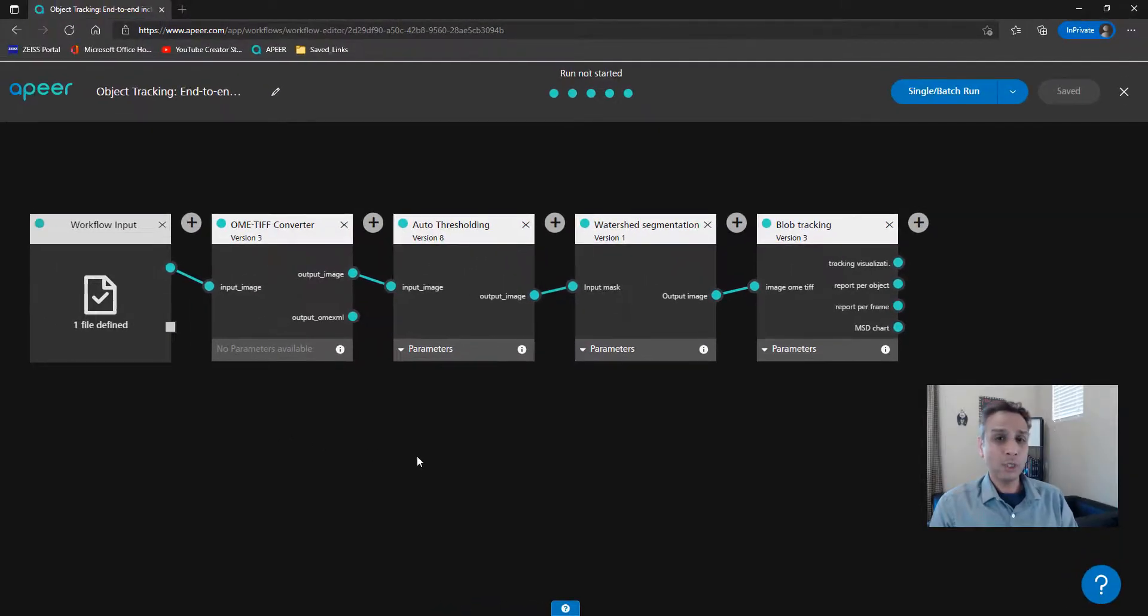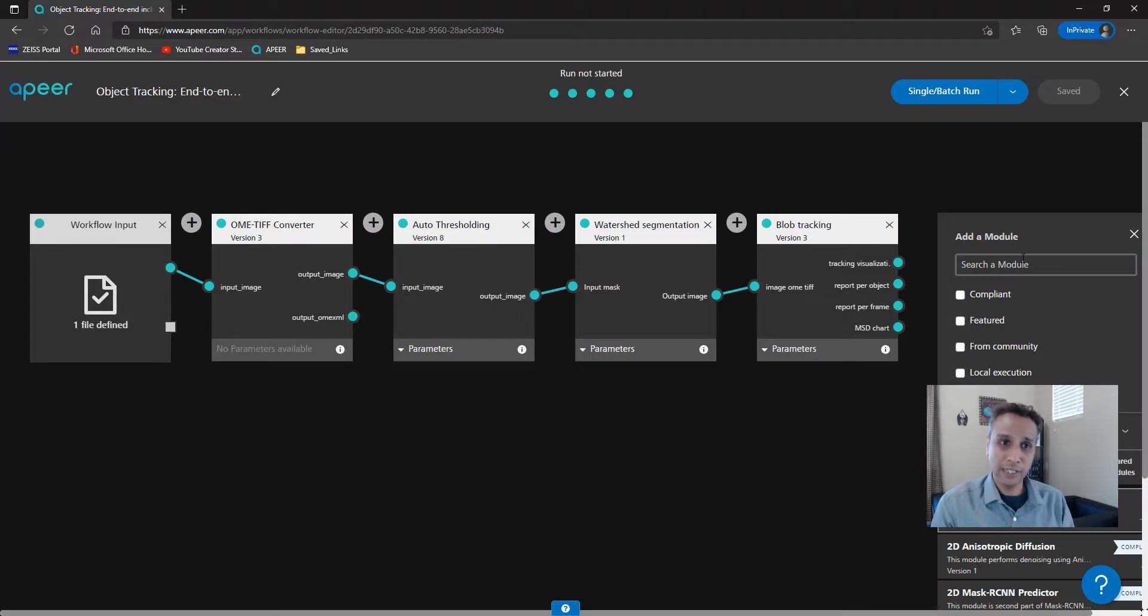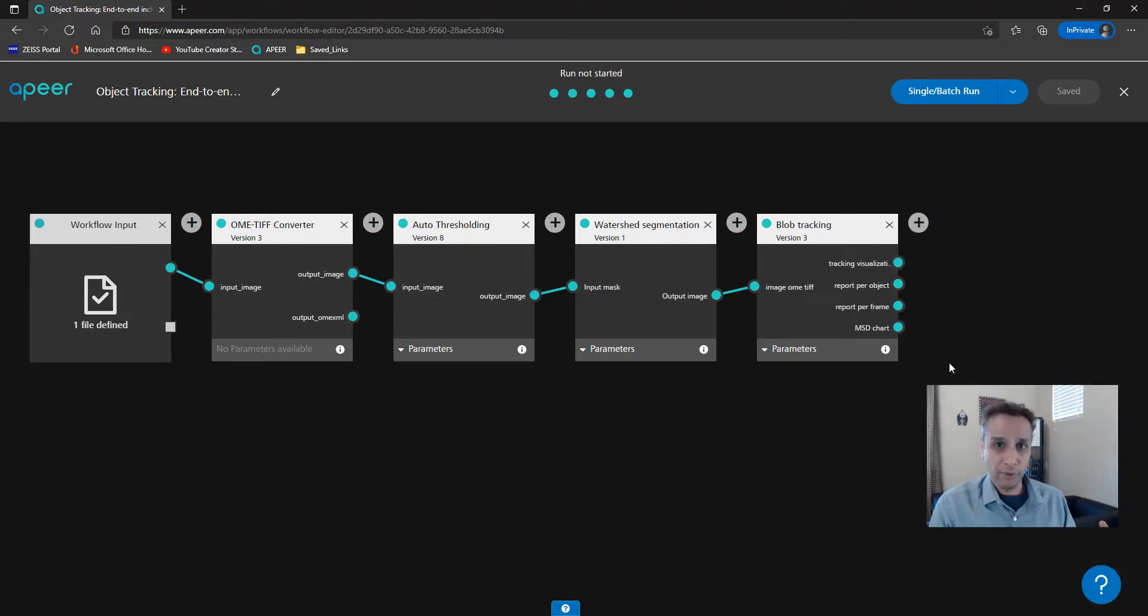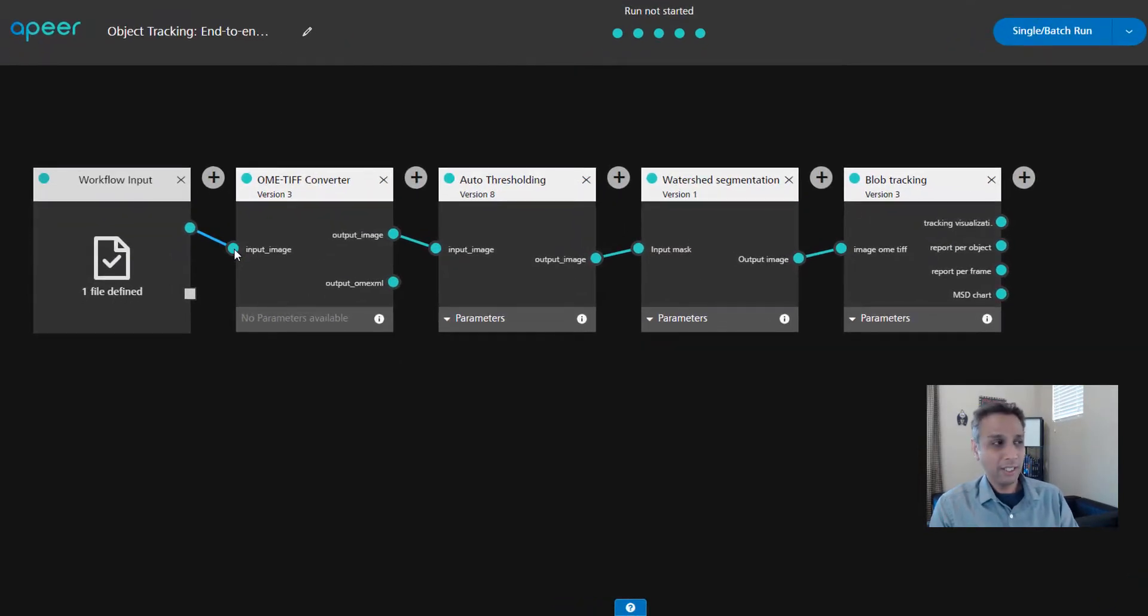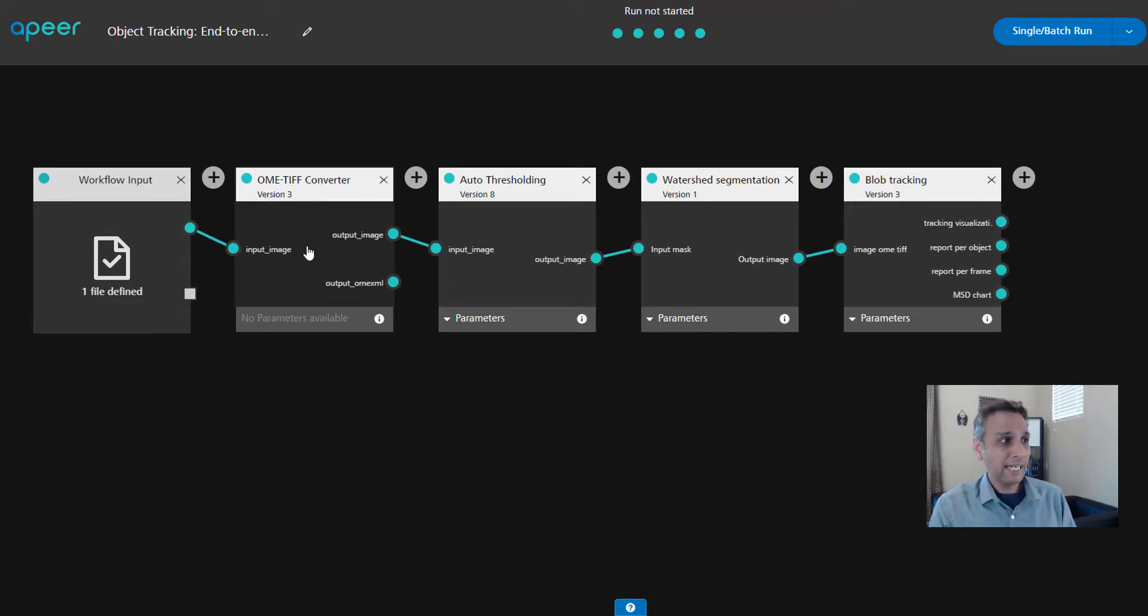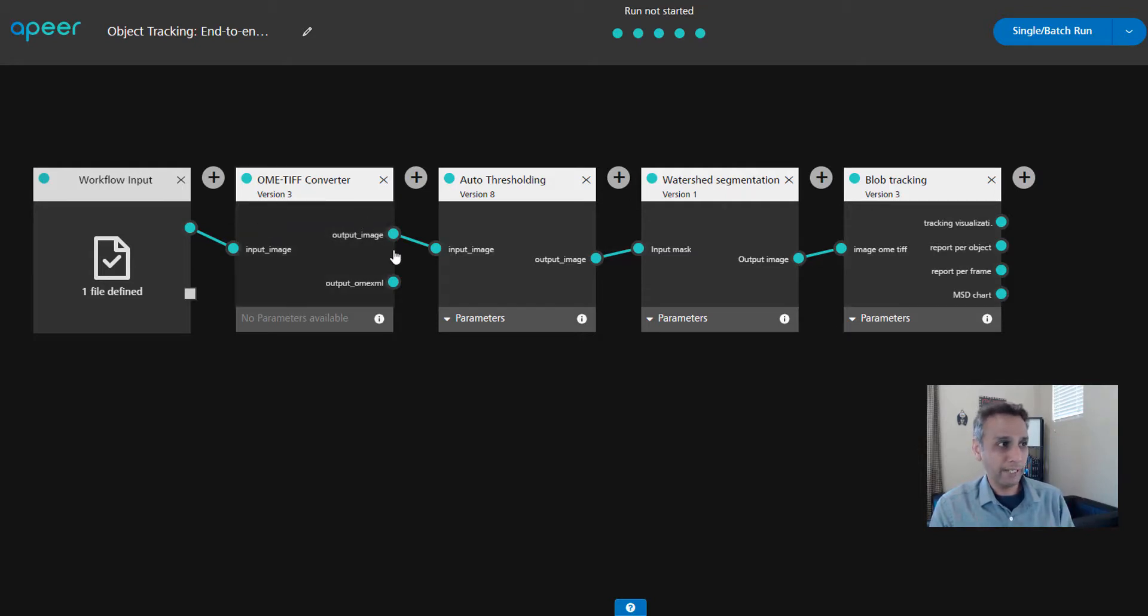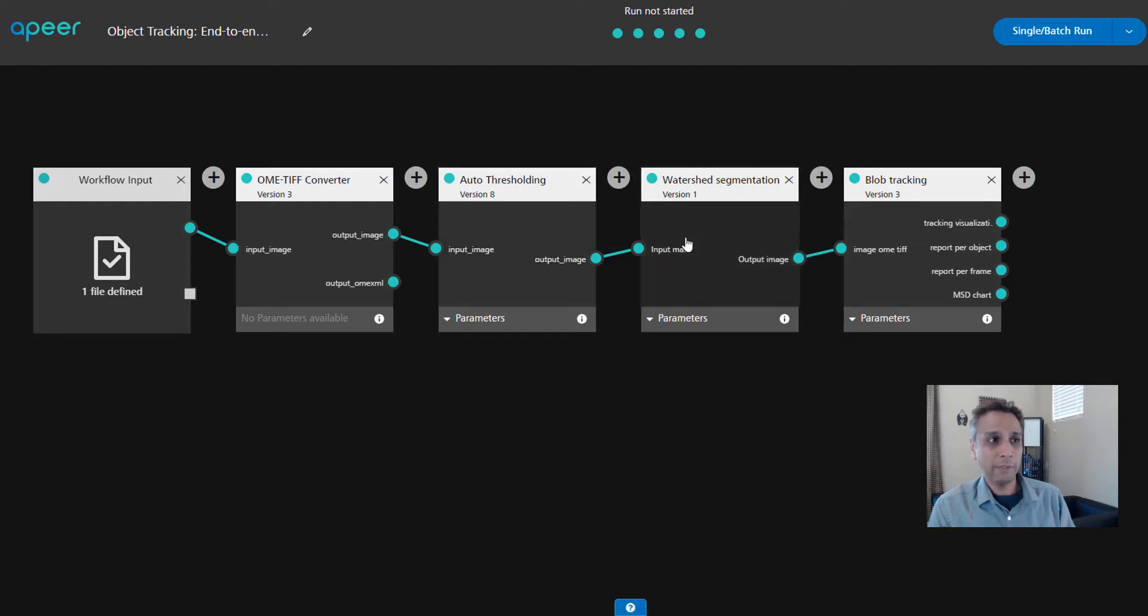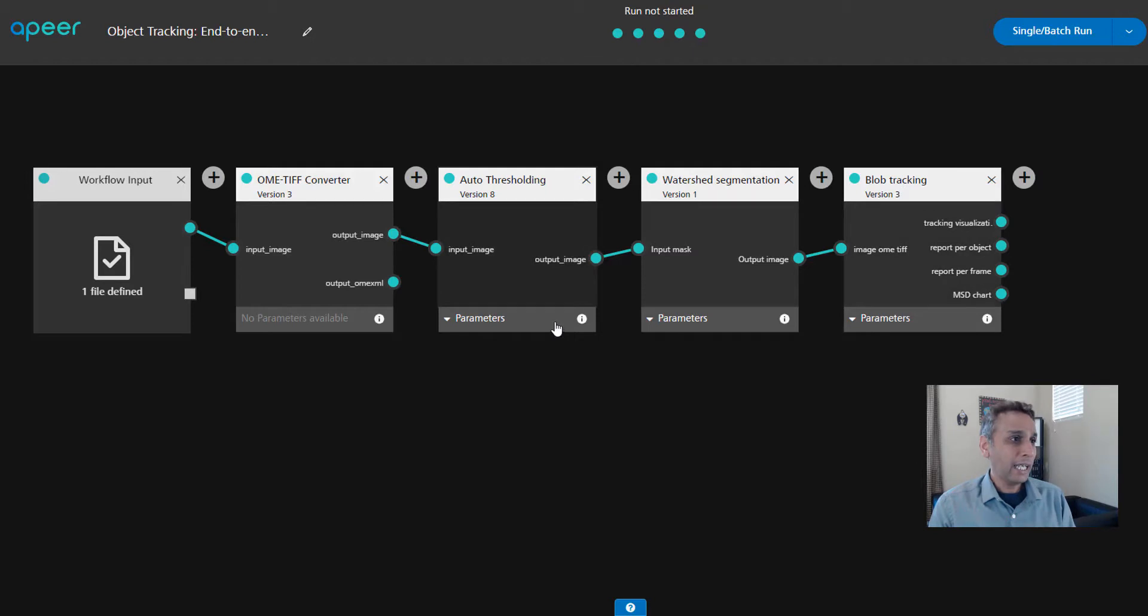Let's go ahead and open this workflow to have a quick look. This gets opened into what we call a workflow builder. This is where you can edit, you can build, you can add another module if you want. The input file gets defined here, and the input file goes as input to the next module, which is our OME TIFF converter. The output of this goes as input to the next module and so on. This CZI file first gets converted to OME TIFF, then that goes to auto-thresholding, then the thresholded image goes into watershed segmentation, and finally, the watershed segmented image goes as input to the blob tracking module.